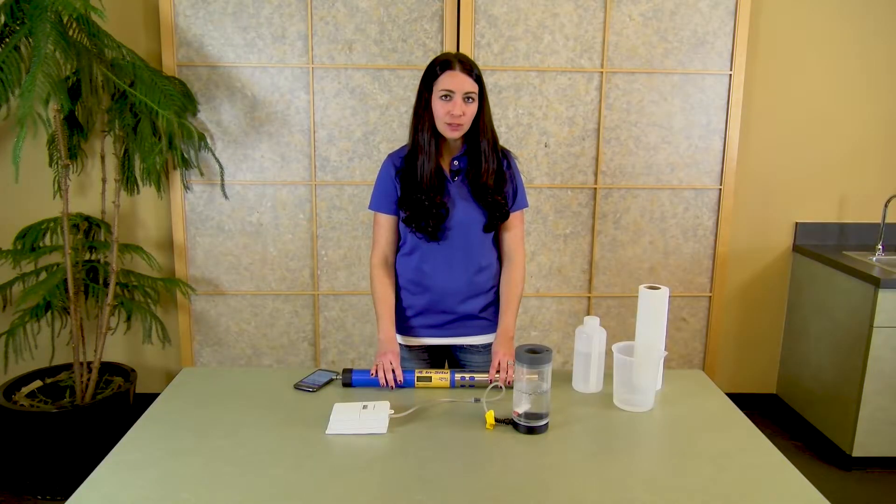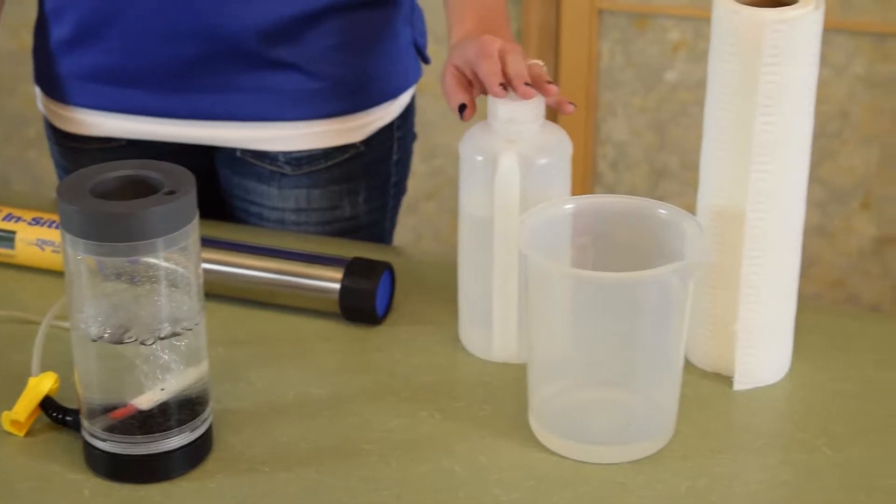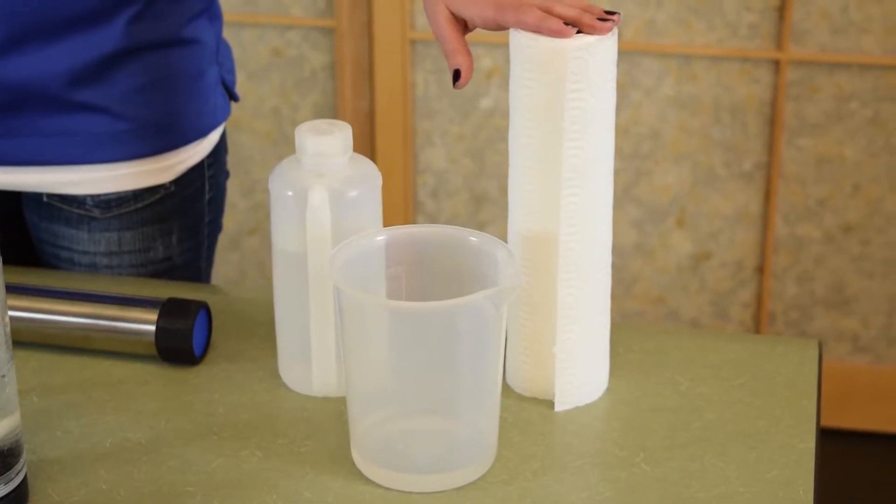Prior to beginning the calibration, there are a few pieces of equipment that you want to make sure to have. You'll need a bubbler, deionized water, a bucket, and some paper towels.